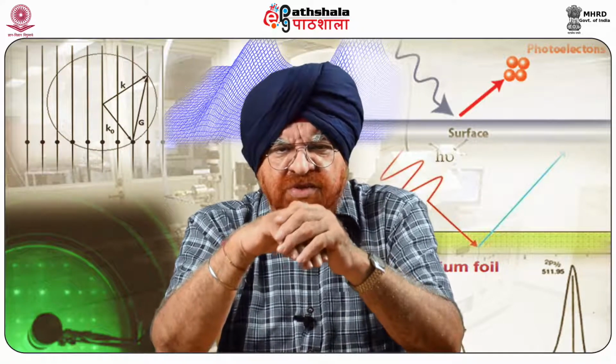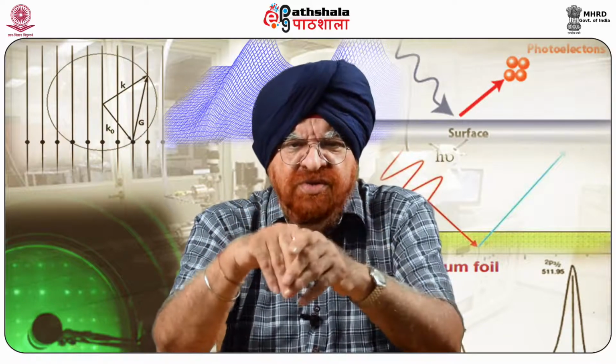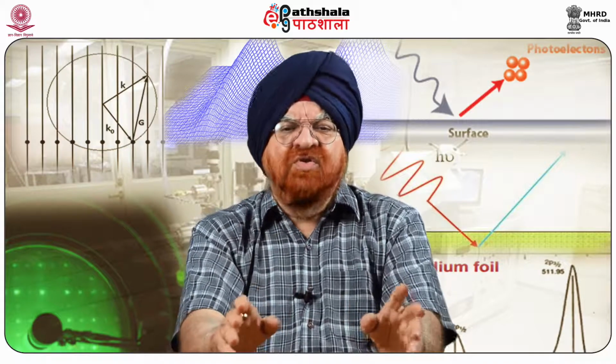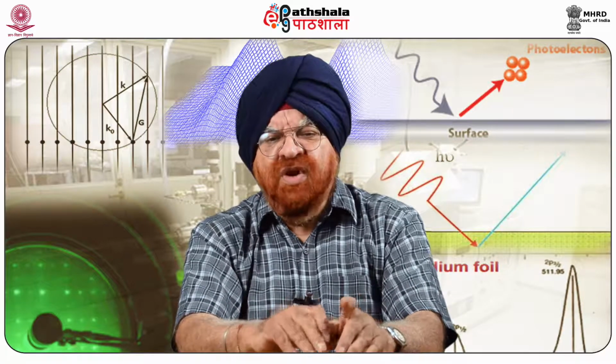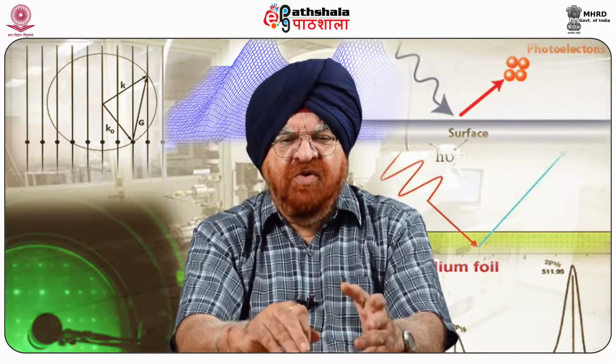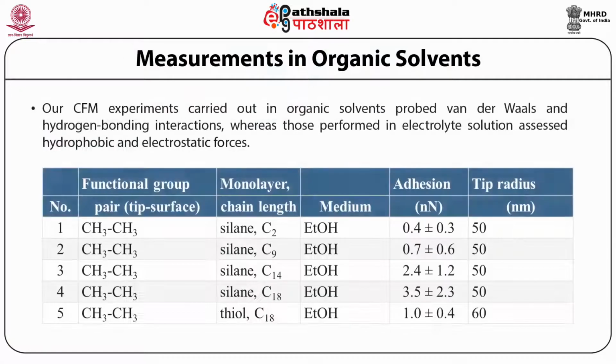When the solvent is immiscible with the functional group, larger than usual tip surface bonding exists. Therefore, organic solvents are appropriate for studying van der Waals and hydrogen bonding, while electrolytes are best for probing hydrophobic and electrostatic forces. Measurements in organic solvents: chemical force microscopy experiments carried out in organic solvents probed van der Waals and hydrogen bonding interactions, whereas those performed in electrolyte solution assessed hydrophobic and electrostatic forces.